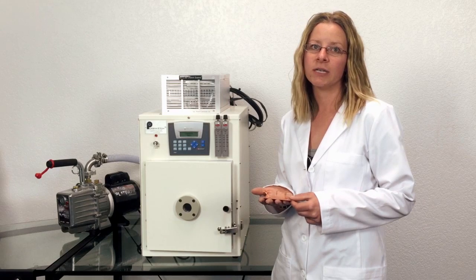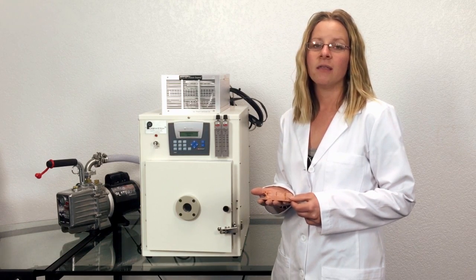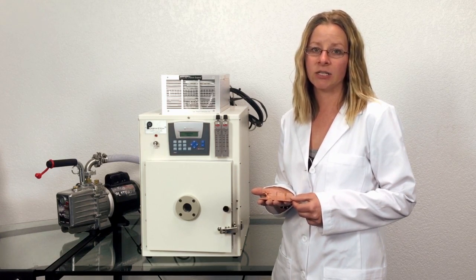Hello, and thank you for your interest in the Plasma Etch PE75 Plasma Etcher. This particular system is a high frequency model. This system can treat up to an 8 inch sample size.